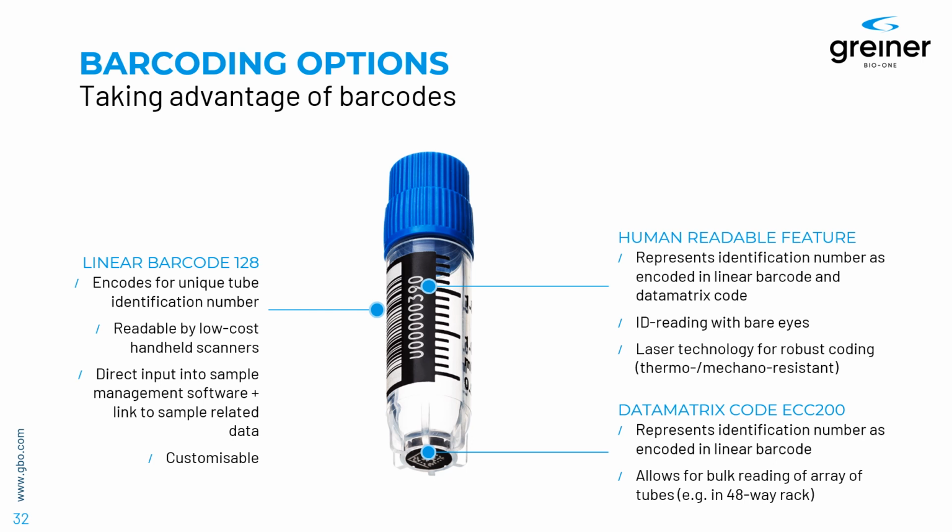And also, the unique identifier is represented in the form of a data matrix code. Here, the idea is that the same identifier, again, can be presented together with other tube identifiers in an array, and here bulk readability comes into play. So you can read an entire rack, often it's a 48-way rack, so you can read 48 identifiers at once. You also get positional information, so you know which tube with which identifier was in which rack position. You can relate it to rack IDs, and you can relate it to individual IDs of individual samples.